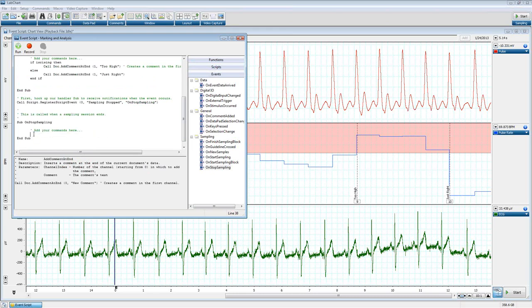Oh, I messed that up. That's okay. I work on a Mac normally, so I did Apple. That didn't work. So I did Apple copy. So we're going to do that again.